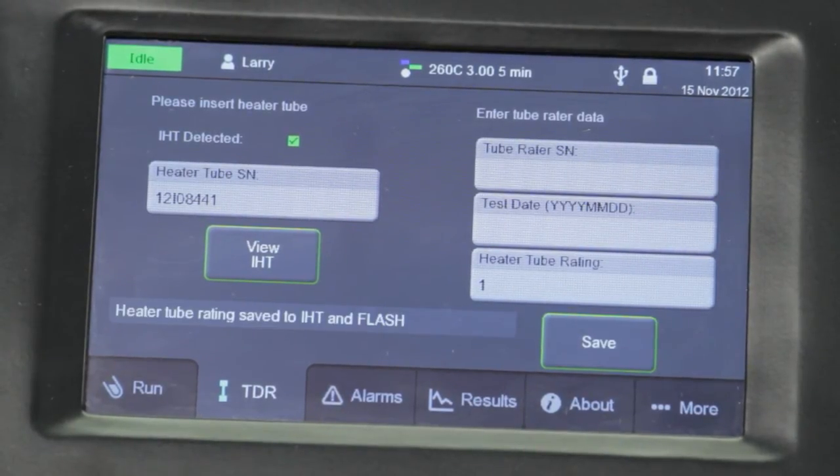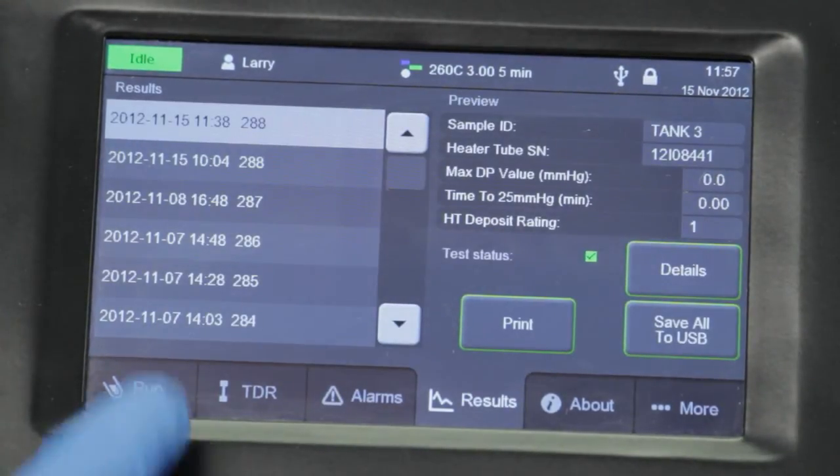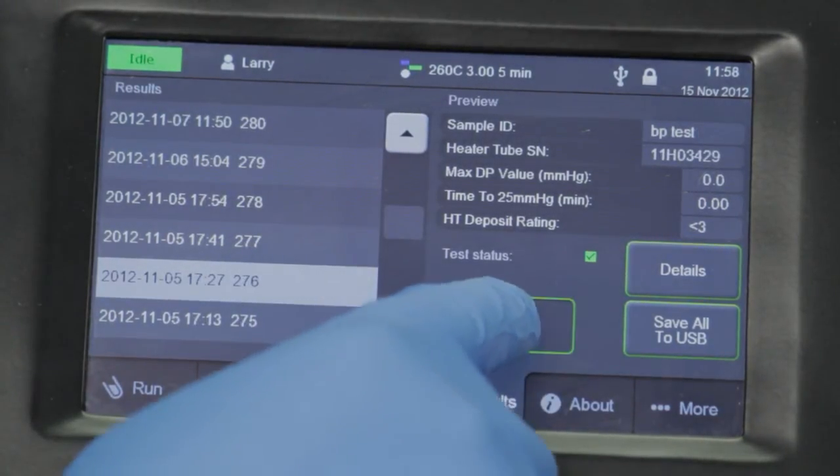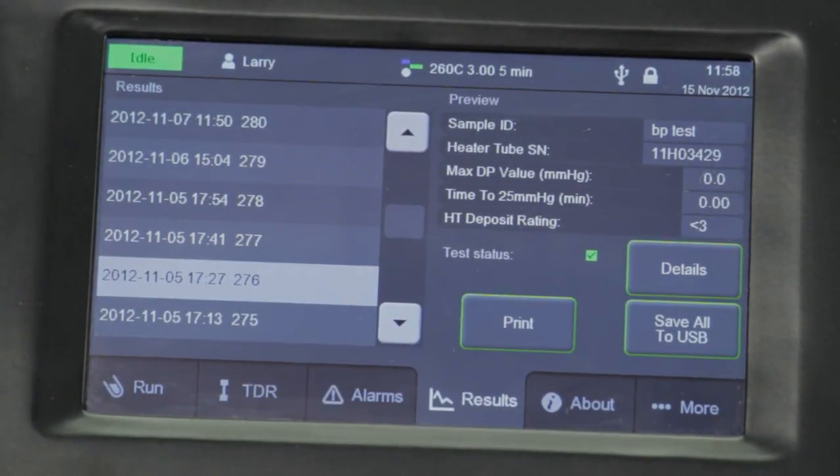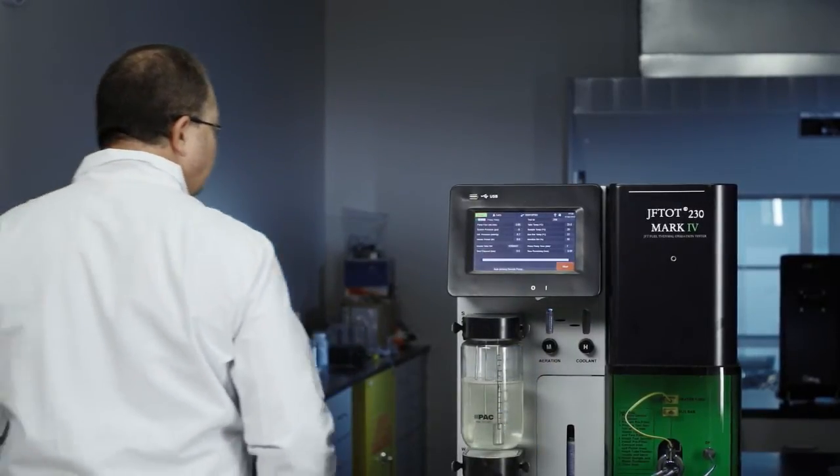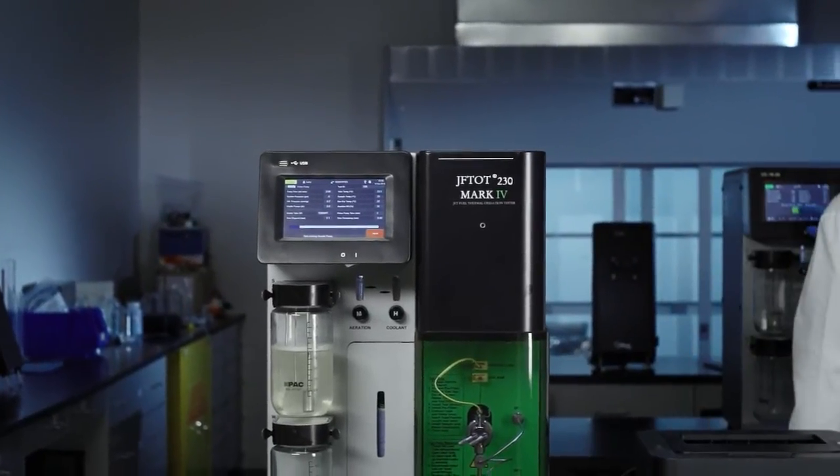100 tests can be saved on the unit and can also be saved on a USB drive. You can see the test results on the screen as well as print them from the results tab. In addition to being safer, smaller and simpler, the Jephtot 4 automates activities that have traditionally been time intensive, like pump priming, flow monitoring and sample aeration.